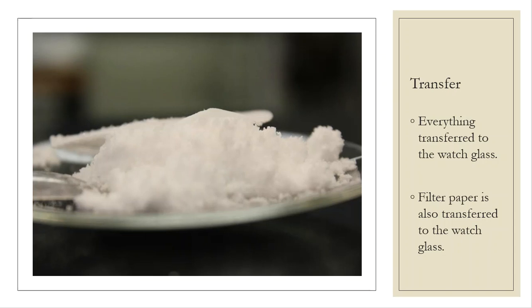Not just the clathrate compound, but just the alkane on its own. So that's going to be a different measurement toward the end of this experiment.